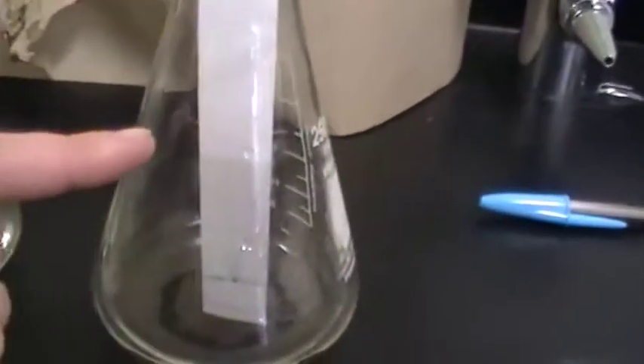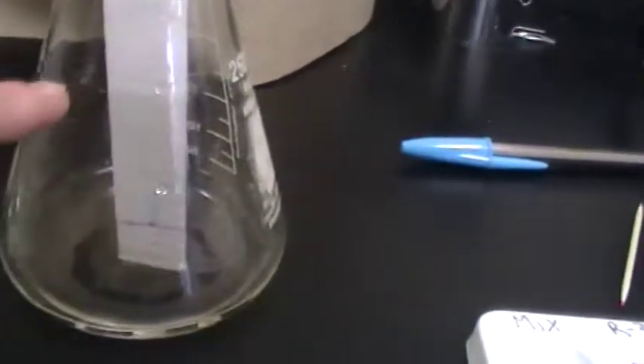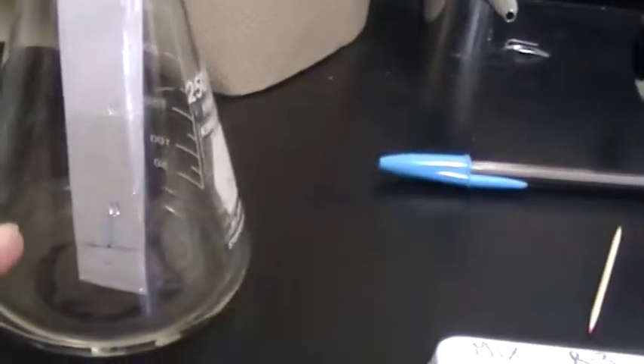And then we have — look — here we have our solvent front so far, if you can see it. It's kind of darker. And then here we have our solvent going up. And then there's our dye right there — the blue spot.